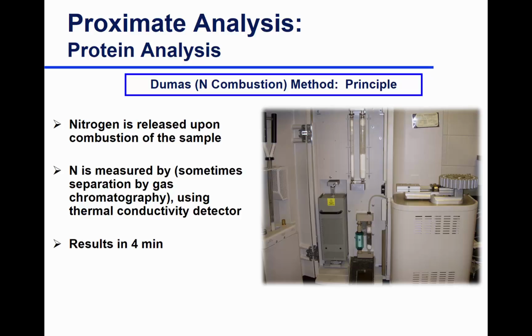Okay, so you've all had lab. What are the two major methods for determining protein content for proximate analysis? Just say Dumas and Kjeldahl. So we've already done Kjeldahl, so let's talk about Dumas.